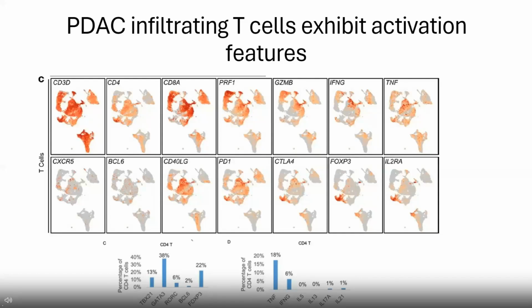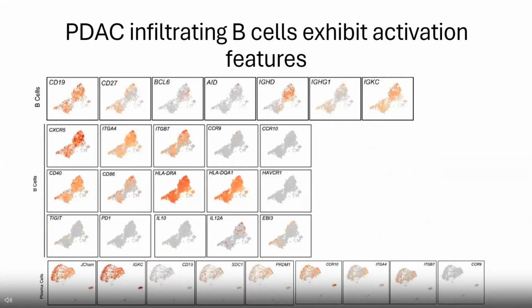It's representing about 20%. So in general, the T cells do express activation status, but also show some potential immunosuppressive features as well. When we look at the B cell and plasma compartment, for example, here B cells were highlighted by expressing CD19, also CD20. There are some populations that still express a naive B cell marker such as IgD, but we can see that many also express isotype switch such as IgG1 here.